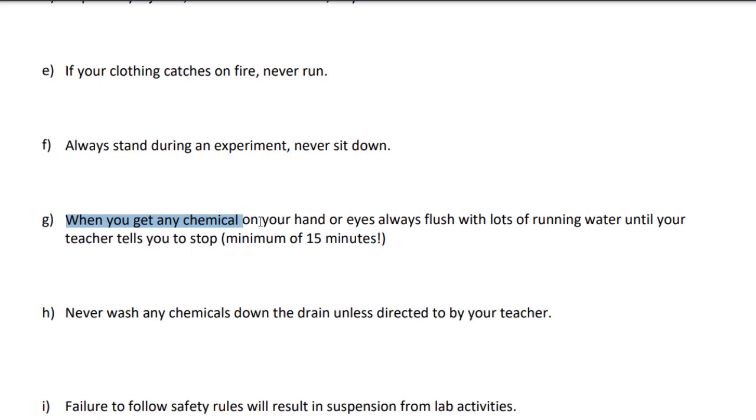When you get any chemical on your hand, or in your eyes, flush it with lots of running water until your teacher tells you to stop, minimum 15 minutes. What are you trying to prevent here? So this one here, some chemicals anyway, are actually able to burn you just like a fire could burn you. In fact, they can even do worse damage than a fire could do, or very similar damage. So you want to make sure that you're getting that chemical off of you.